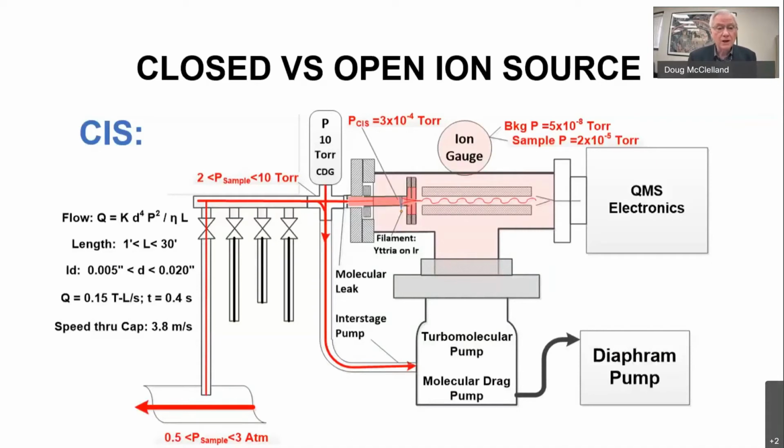Hello, I'm Bob Ellefson, and I want to talk to you about some of the details of the gas dynamics of the sampling system and the analyzer, the Quadrupole Mass Spec. If you look in the lower left-hand side, we represent a process here where the gas typically is a half an atmosphere to 3 atmospheres, and we sample from that by inserting a capillary as a T into the flowing process.